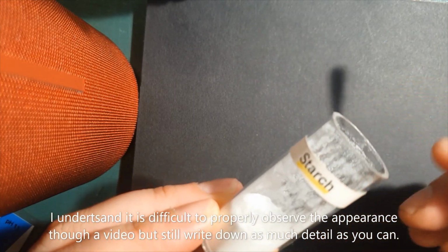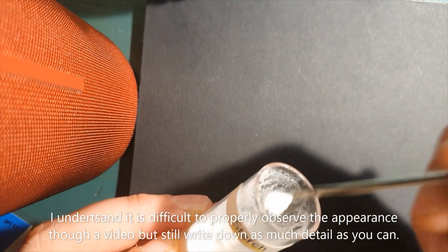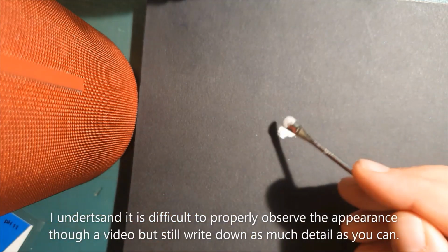Okay, so we'll start testing. Make sure you have your table out, and we're going to go through each thing, and you need to write down the results that you're observing. So the first powder we're going to be testing is starch. Now the first thing we're going to look at is just the appearance of the starch. So I'm going to put some down here.